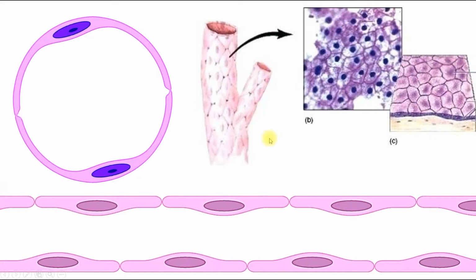And let's look at their structure, histological structure of micro blood vessels. Here we can see a structure of capillary, and all blood vessels beginning from capillary till big arteries and veins and even heart, their inner lining is provided by endothelium. Endothelium is special type of epithelium. It's simple squamous epithelium. Here we can see simple squamous cells. And the same cells are in the capillaries, in the arteries, in veins, and even in the heart chambers.